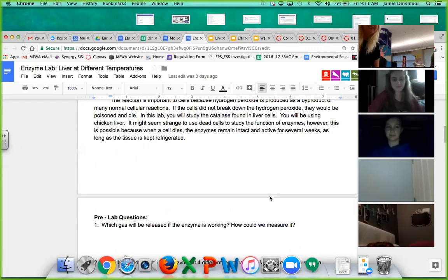Oxygen, thank you. Okay, there we go. So oxygen is the gas that's gonna be produced, right? Do you guys have any idea how we could measure it? Can we measure it? We're gonna talk about how we could measure it in a little bit, right? There is a way we could prove oxygen's there.